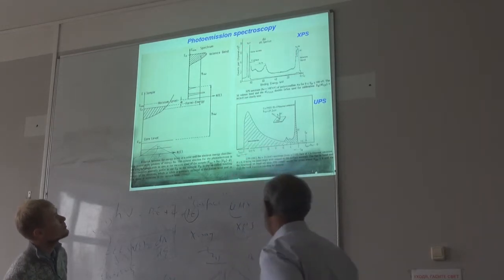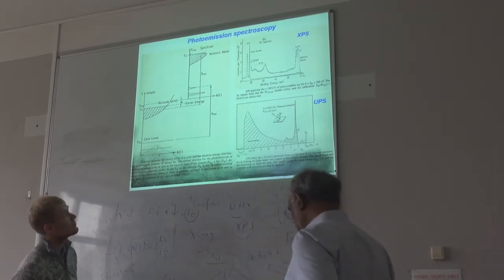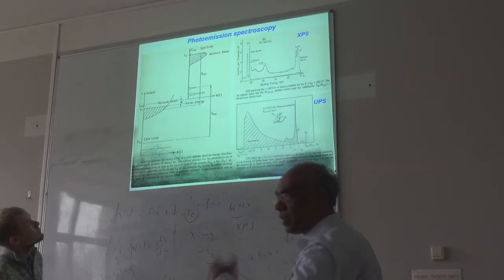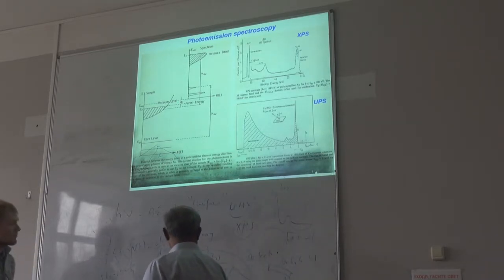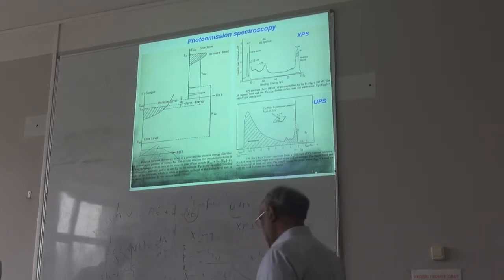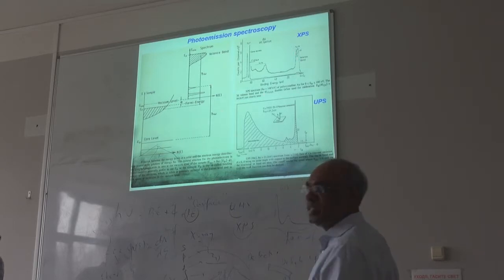So from any energy level, you can see the electron energy in the XPS, or even gold 5p. Everyone is familiar with s, p, d, f. Each level has s, p, d, f sublevels, right? So if any electron is coming from a p level or d or f, you can see everything in the XPS spectrum. That's a very easy thing to do.